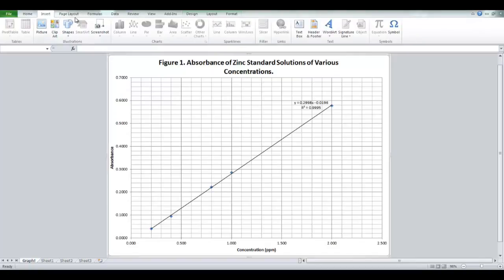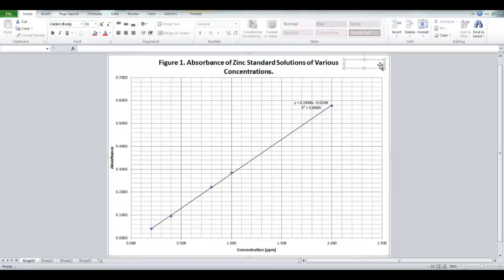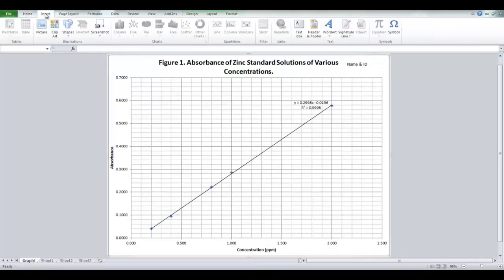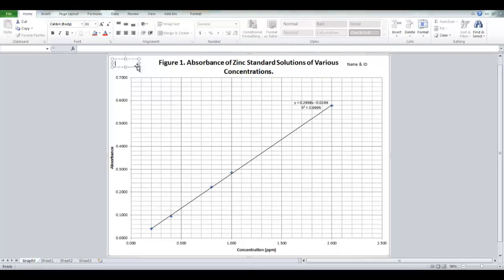So, very, very important step here that you're going to want to do. Go over to insert, text box, and simply put in your name, student ID, and the date. So, if I went a little bit fast, you go up to insert, text box, insert your text box, and put the date.